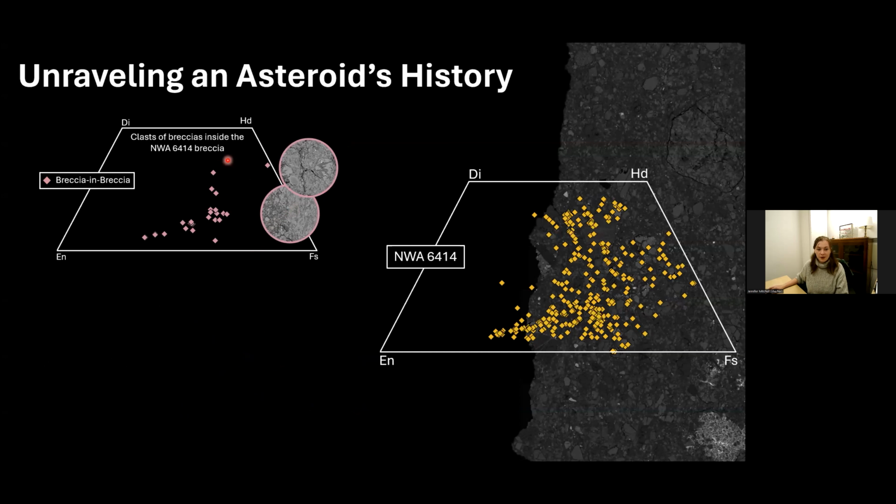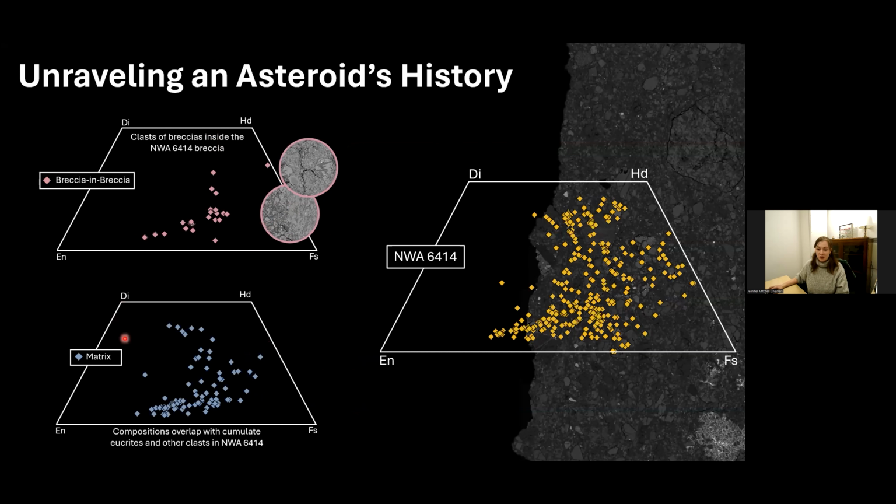And then if we look at those compositions, they're also HED class, which is quite nice. So no evidence of a meteorite impactor preserved in this meteorite so far. But we do have this nice mixing of different compositions inside our meteorite. And then if we compare everything else that we're seeing, we've got fragments in the matrix basically composed of every other lithology that we're looking at. So there's no real diogenite material in here, but we do have basically the entire run of eucrite compositions.